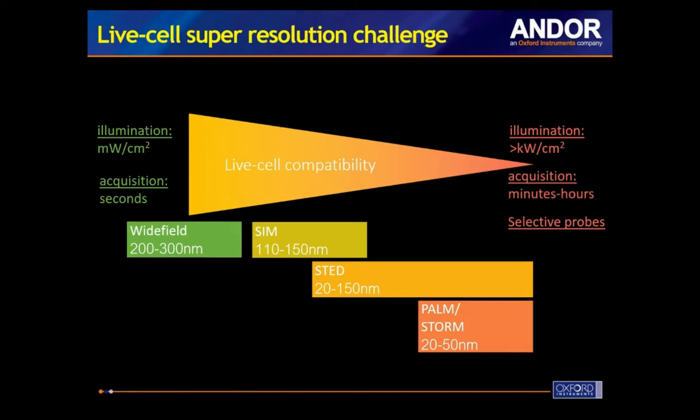And this is due to high laser power requirements, also to the acquisition timings that can be from minutes to hours, and therefore you have a problem in delivering the temporal resolution needed for live cell imaging in many experiments, and also very complex probe preparation.